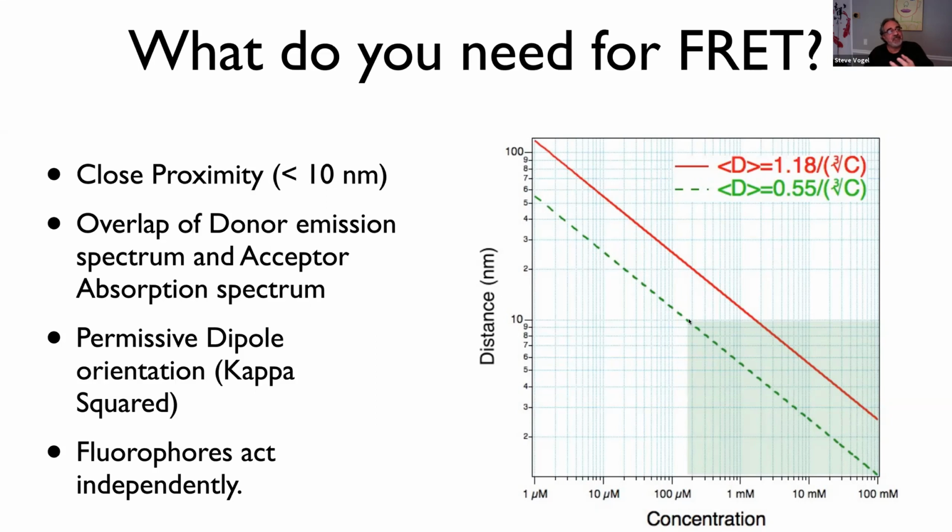It's not because they're married to any of those people. They're just stuck in an elevator together, right? Same thing with molecules in solution. So if you're working at concentrations above like 200 micromolar, everything is going to be fretting with each other. Not because they're binding to each other, just because they're crowded. So it's important to work at low concentrations to avoid this artifact.